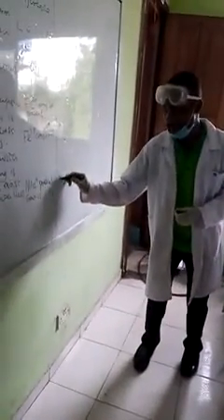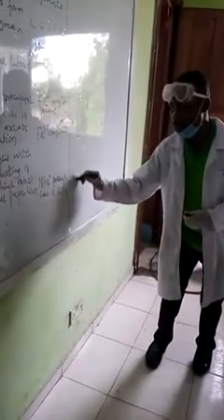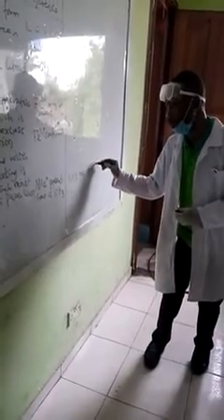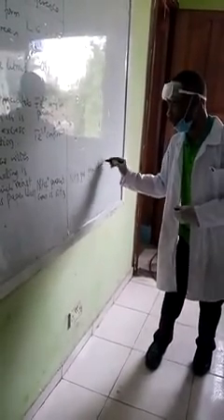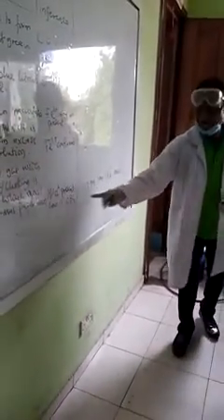That's another way to put it. You can just write it in formula form. Ammonia gas from ammonium ion present. It's either you write it like this or you write it like this.